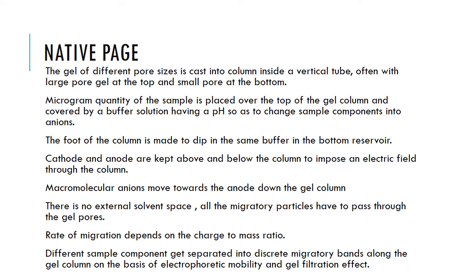In gel filtration chromatography, small particles move through the pores, while large molecules move using another space, the solvent space. But with this method, all the molecules are forced to move through the pores. They do not move using any other space.